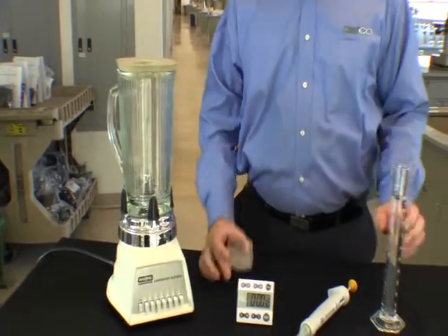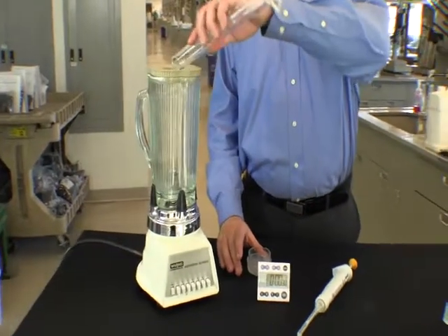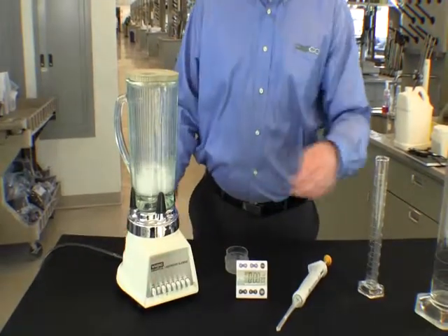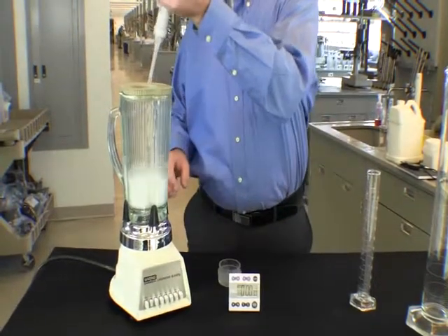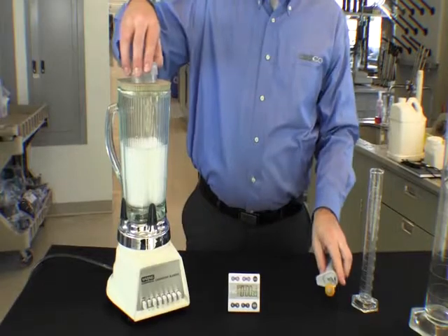We then pour the water into the chalice. We start the warm blender at a speed of 1 and disperse the VersaFoam Plus into the swirling water. We replace the lid and increase the speed to 7.